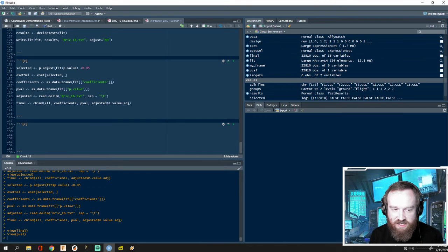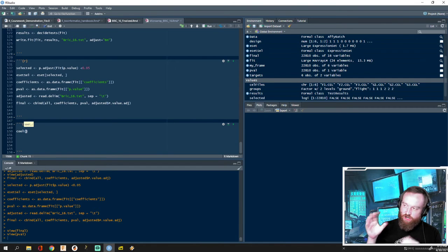Beautiful. The last thing we're going to do is we just want to take a look back at our experiment and see to make sure the groupings of our experiment make sense, in that how similar were the expression changes in all three of those flight experiments or flight chips versus the 3 ground controls. And I added this at the end because it can take a little bit of time.